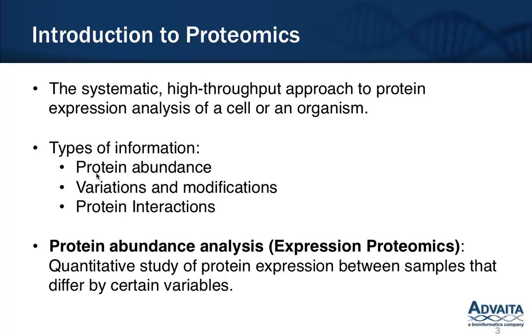In this webinar, I'll be concentrating on analysis of protein abundance, which is also called expression proteomics, which is defined as the quantitative study of protein expression between samples that differ by certain variables. As I mentioned, this is very analogous to mRNA expression studies, where you have 2 different samples that you want to analyze for different mRNA expression. You can do the same exact thing with protein expression.